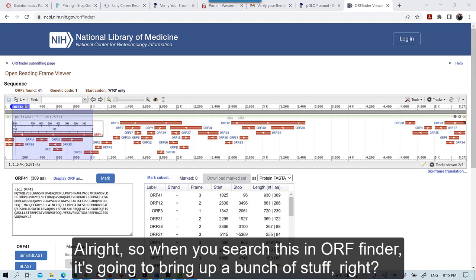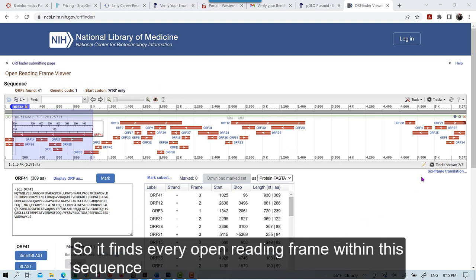Alright, so when you search this in ORF Finder, it's going to bring up a bunch of stuff, right? So it finds every Open Reading Frame within this sequence.